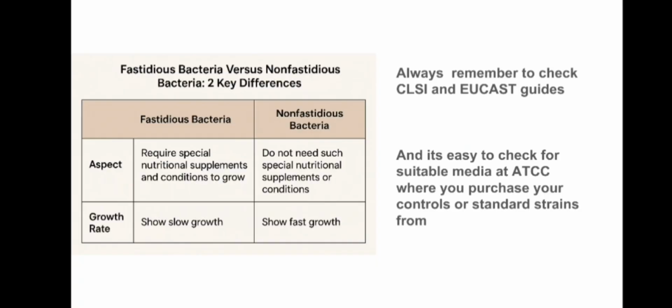While choosing a medium to grow in, the simplest way is to go through the CLSI and EUCAST guidelines and their booklet. It will always suggest for this bacteria we have to use this agar media. You can also find it in ATCC if you are in America, and MTCC if you are based in India.